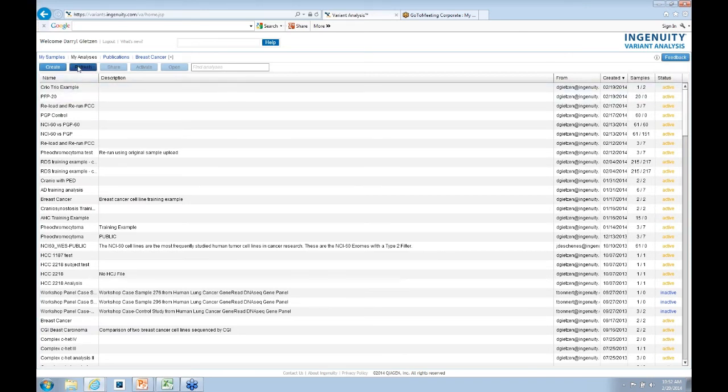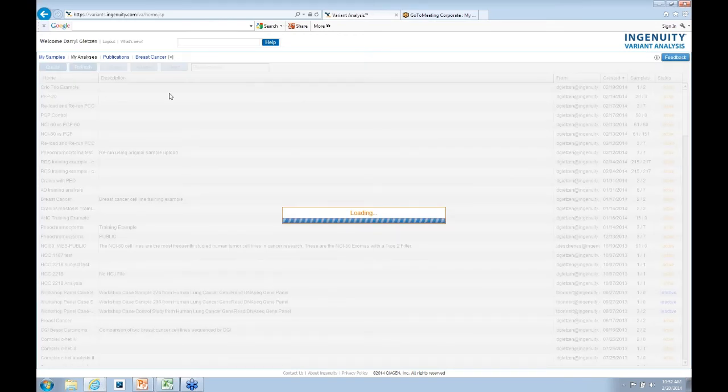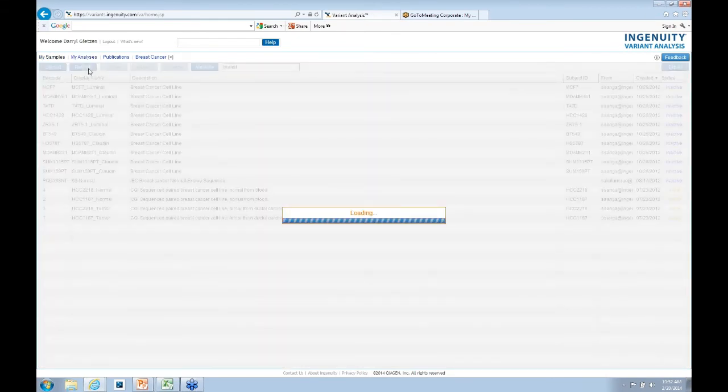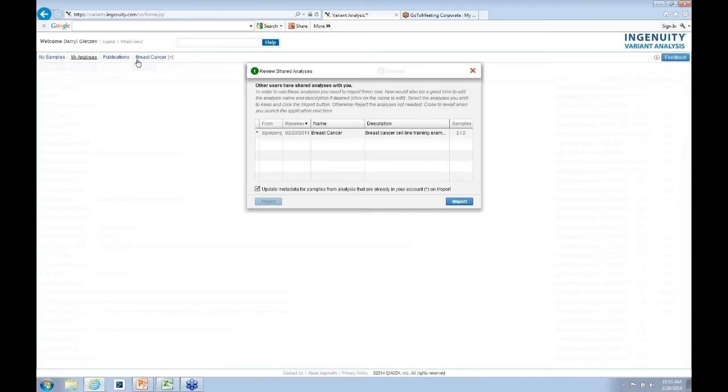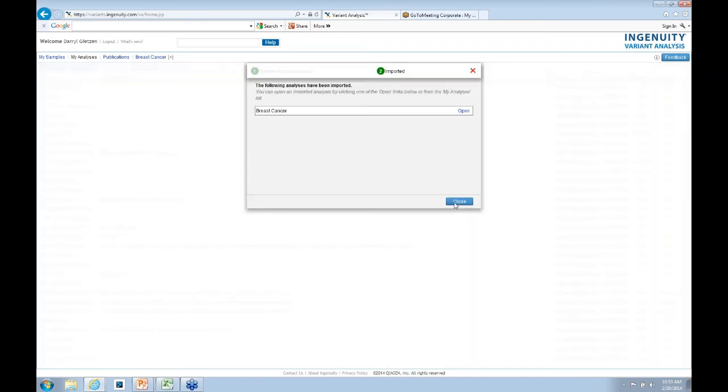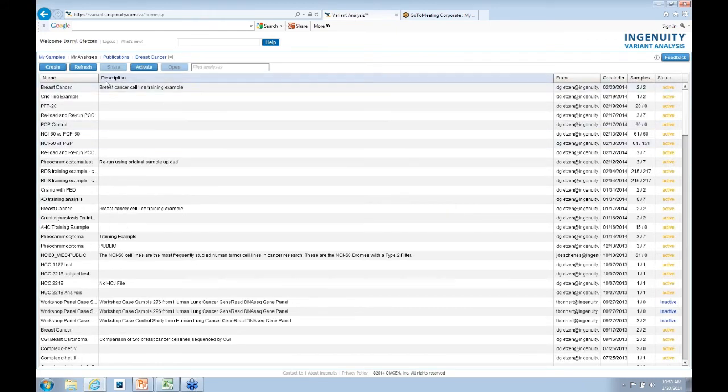Usually I can hit the refresh and then it'll ask me to import. Let me just try one more time here. Oh, here we go. So this is asking me, do I want to import that analysis I shared with myself? Yes, I do. So I'm going to import that now. And close this. And now I have it up here.